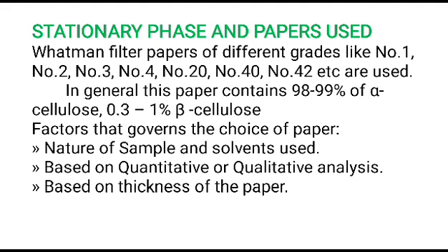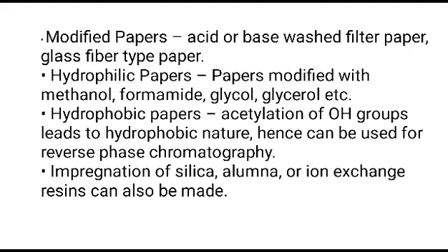Which factors govern the choice of paper? The nature of the sample and solvent used, whether the analysis is quantitative or qualitative, and the thickness of the paper. So we can modify the papers as per our sample. How do we modify the papers? Acid or base washed filter paper, glass fiber type paper.